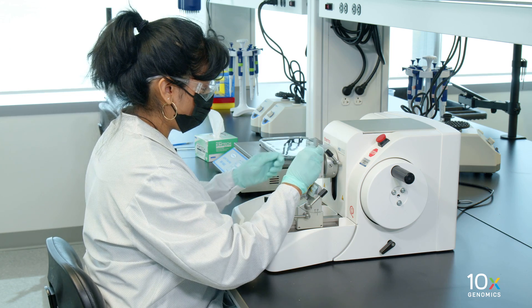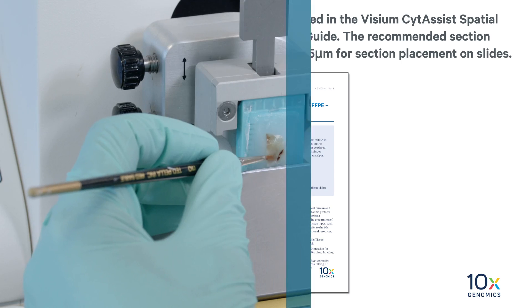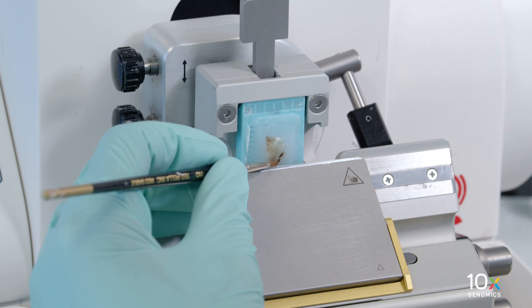Place the tissue block in the specimen clamp and align it with the blade. Set the microtome to the section thickness specified in the Visium CytAssist Spatial Gene Expression for FFPE Tissue Preparation Guide. The recommended section thickness is 10 microns for RNA quality assessment and 5 microns for section placement on slides. For tissue blocks with exposed tissue, discard the first few sections and start collecting on the subsequent sections.